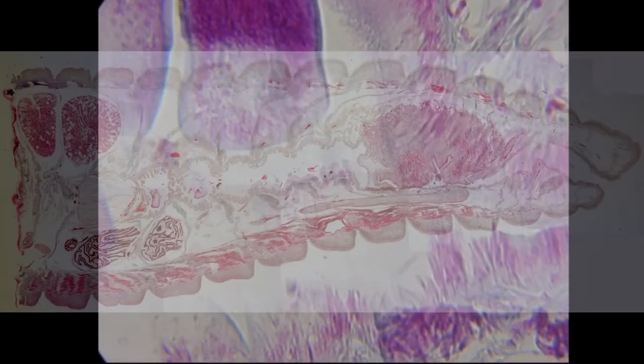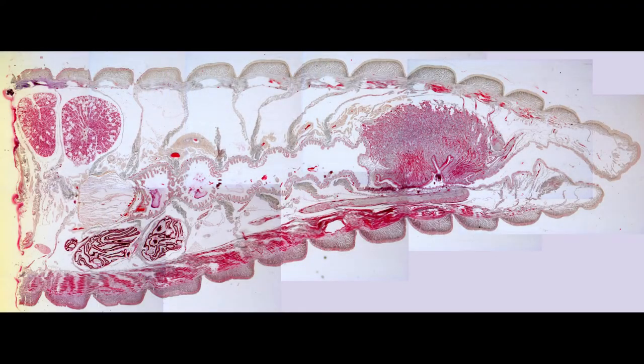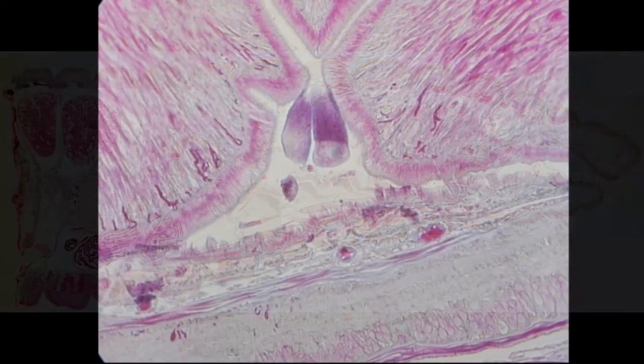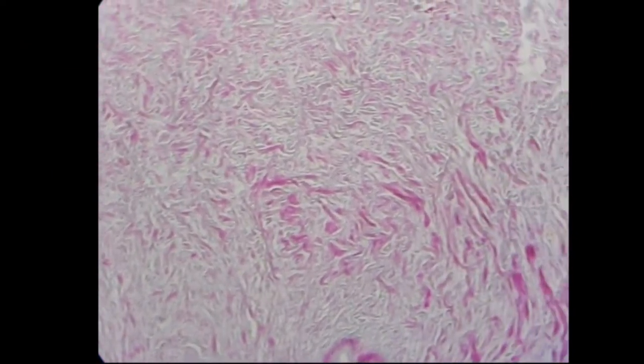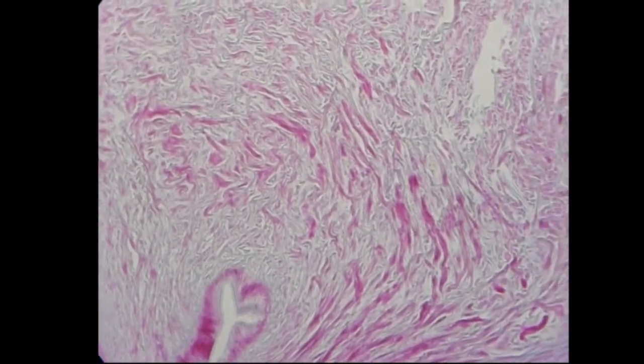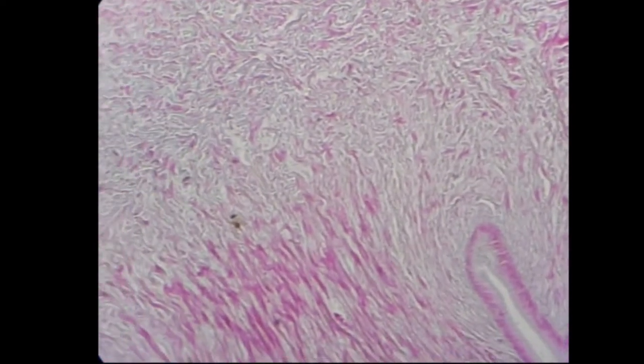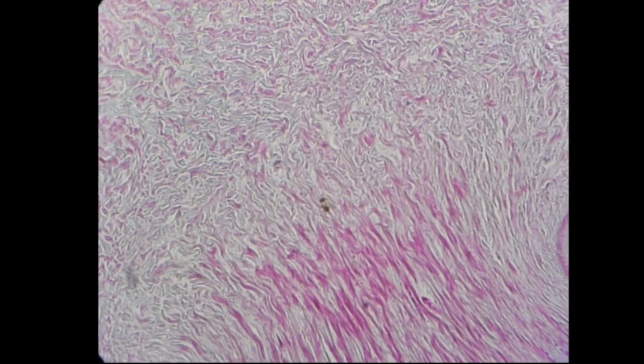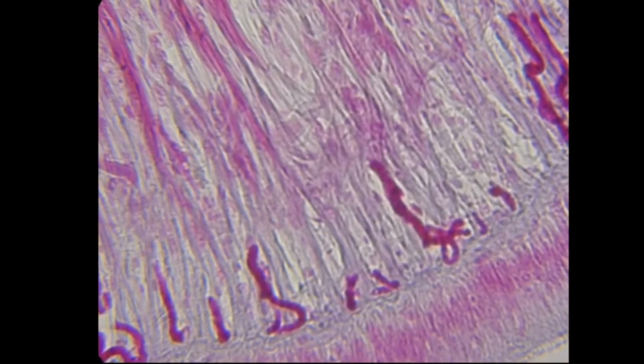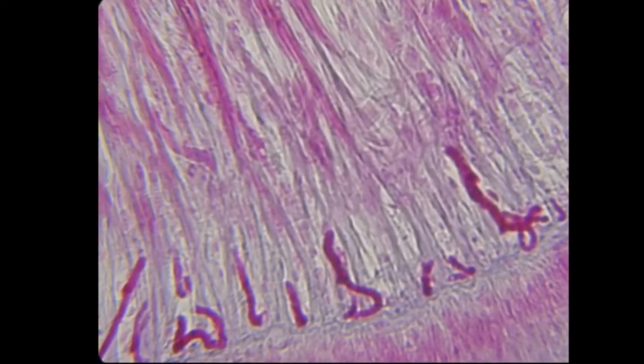Dorsal to the pharyngeal epithelium there's a large mass of red tissue. You might be forgiven for thinking this is the worm's brain, but if we look closer it doesn't look like neural tissue. There are no nerve cells at all. Instead this part is characterized by blood vessels and muscle. The earthworm uses this mass of muscle as a suction pump to draw food from the mouth further into the digestive tract.